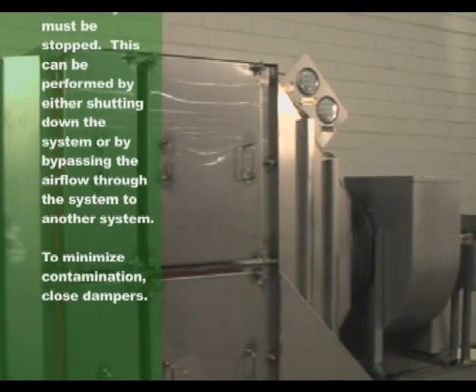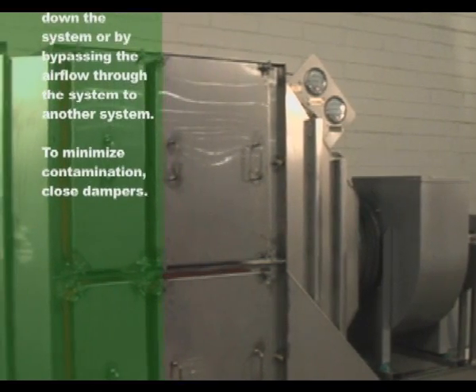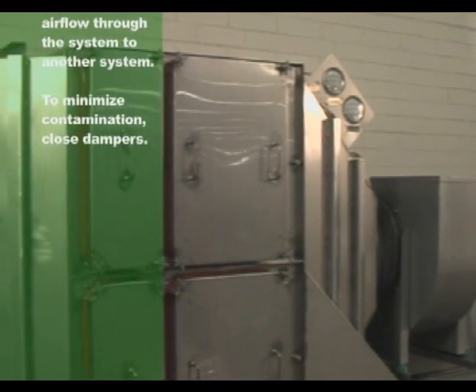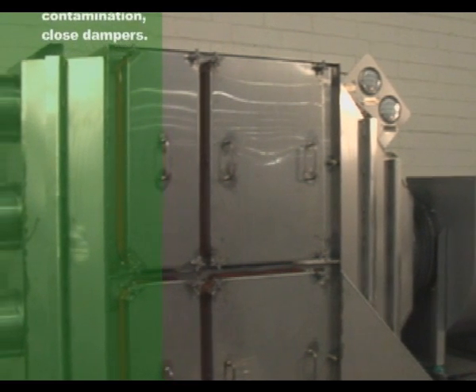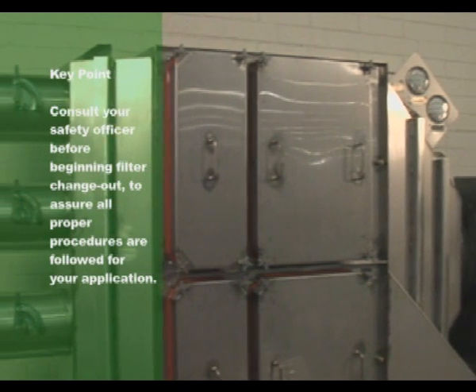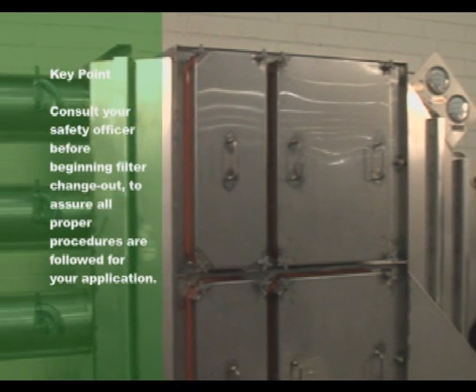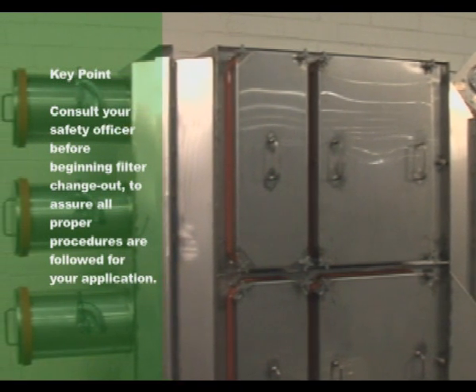To minimize contamination, close upstream and downstream dampers. It is also a good idea to have a table nearby, or a change out shelf available through Camfil Far, to place the new and old filters during change out. Prior to beginning change out procedures, consult your safety officer to ensure all proper procedures are followed for your specific application.